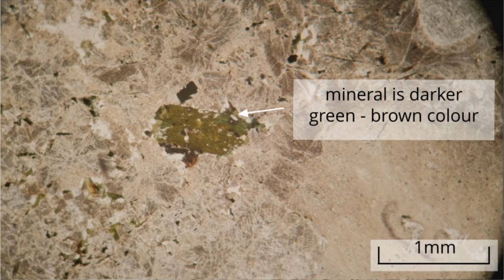Notice that as the stage is rotated through 90 degrees, the colour changes from yellow-brown to darker green-brown colour. This darker green-brown colour appears when the cleavage is aligned east-west. This is the mineral biotite mica.